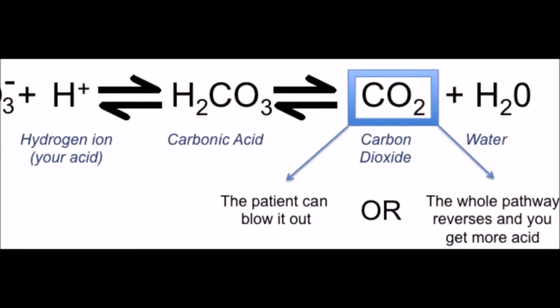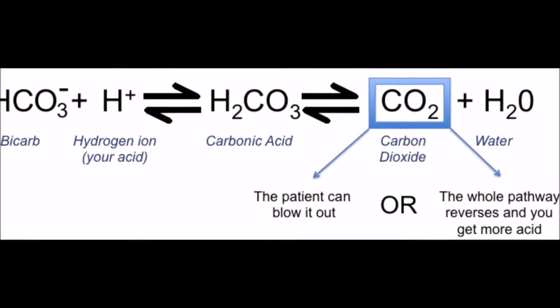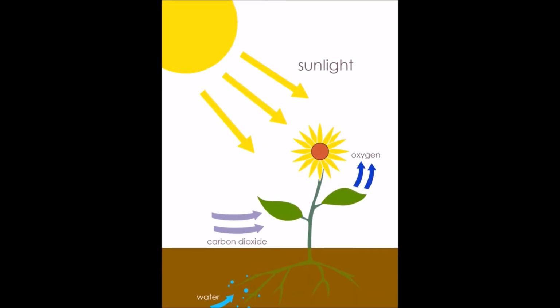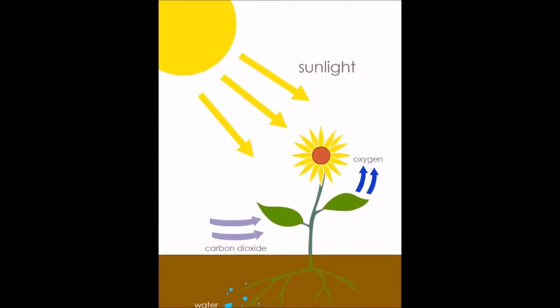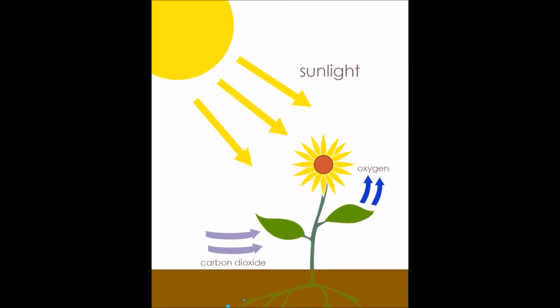We use sodium bicarbonate because sodium bicarbonate dissociates to carbon dioxide. The carbon dioxide is a reactant in photosynthesis, which reacts with the other reactant, water. This causes glucose and oxygen to be formed. Oxygen will cause the leaves to be buoyant and rise to the surface of the solution.